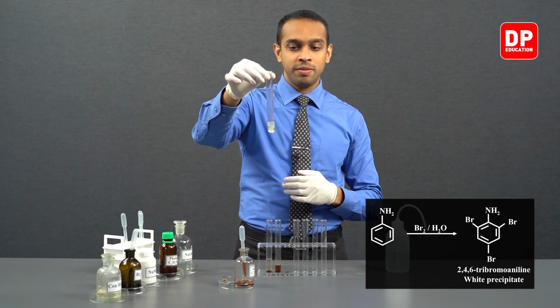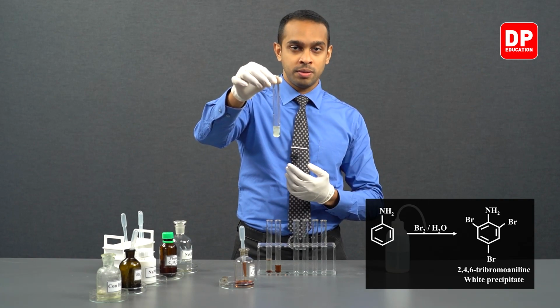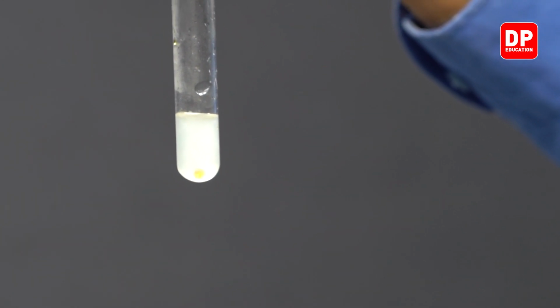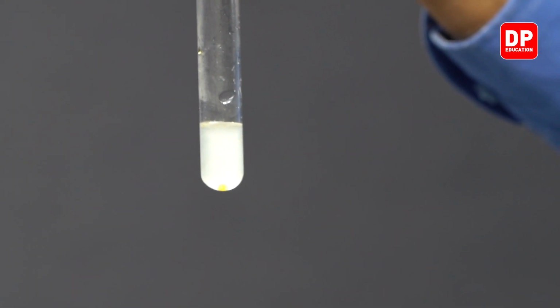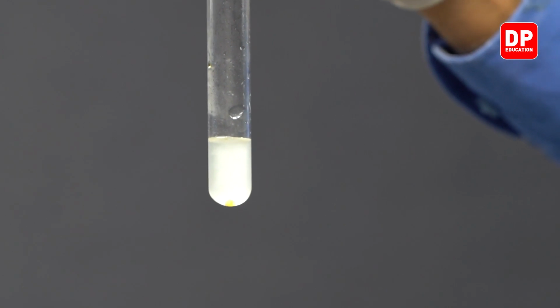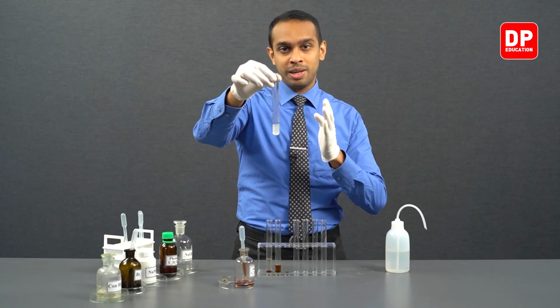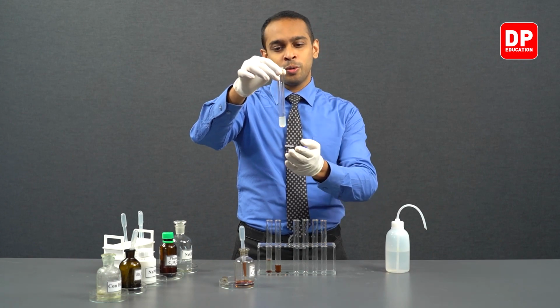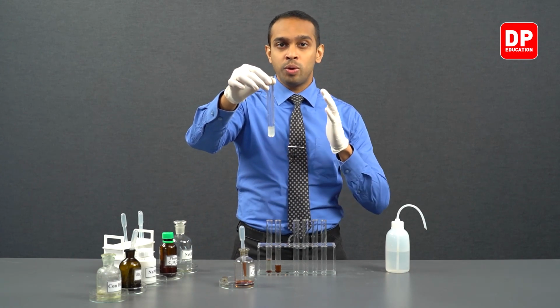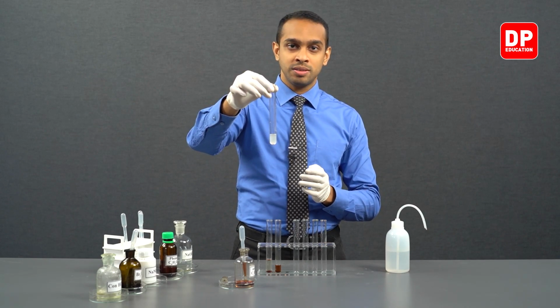And as you can observe here, the color of the bromine water disappears slowly. If you mix it a little bit, we do not observe the color of bromine water anymore. It is completely transparent. However, we have the white precipitate forming, which is 2,4,6-tribromoaniline. So this is the observation when you react aniline with bromine water.